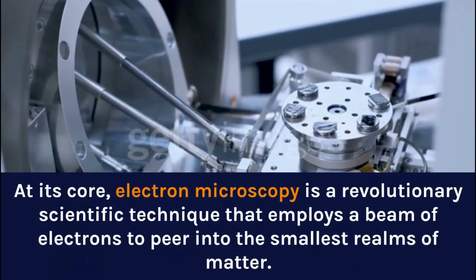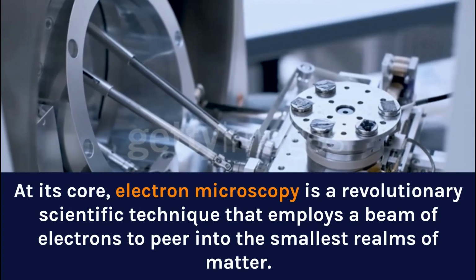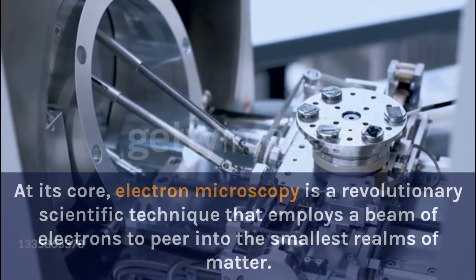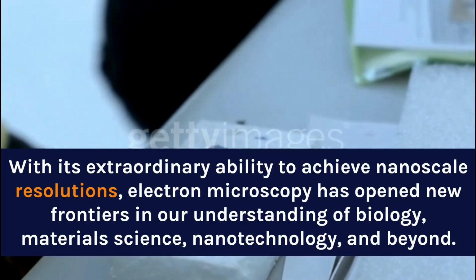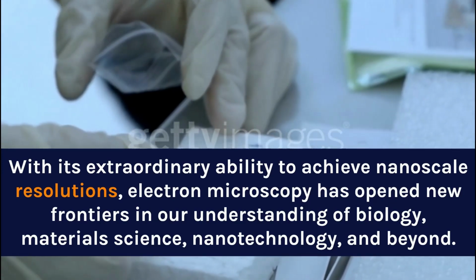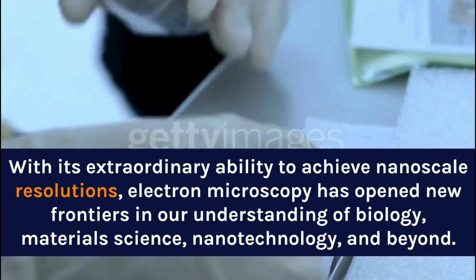At its core, electron microscopy is a revolutionary scientific technique that employs a beam of electrons to peer into the smallest realms of matter. With its extraordinary ability to achieve nanoscale resolutions, electron microscopy has opened new frontiers in our understanding of biology, materials science, nanotechnology, and beyond.